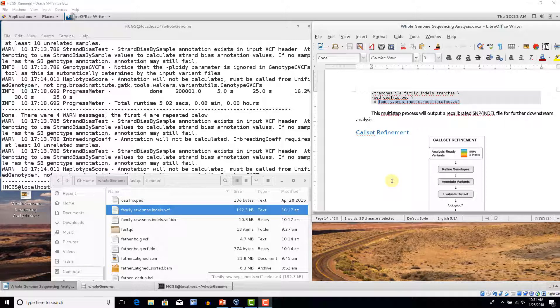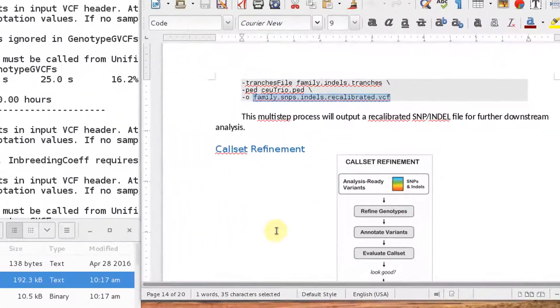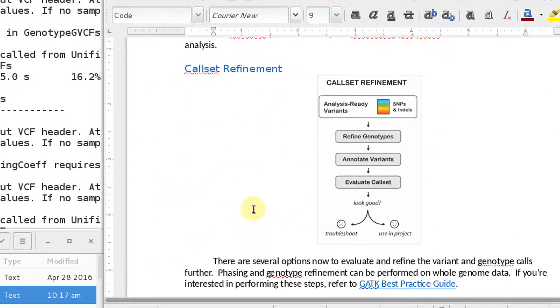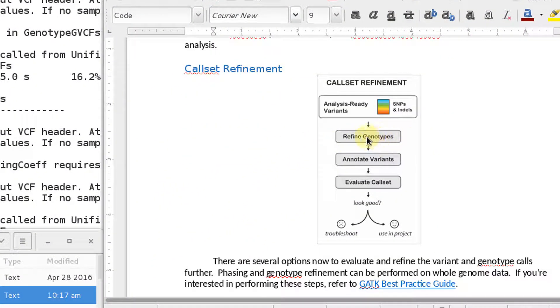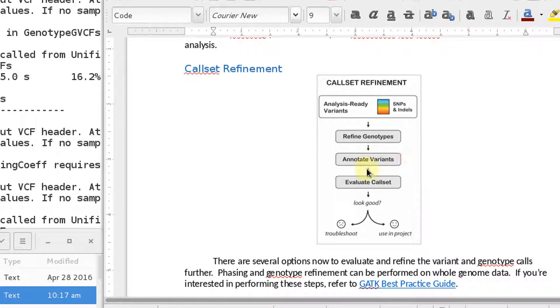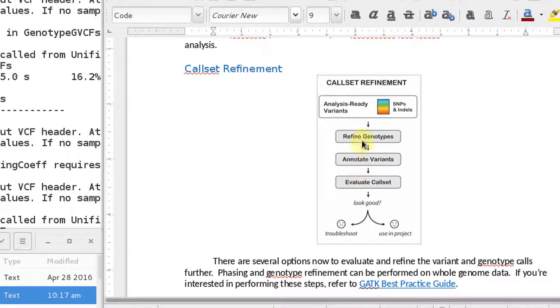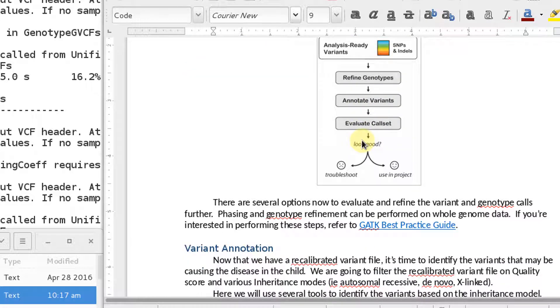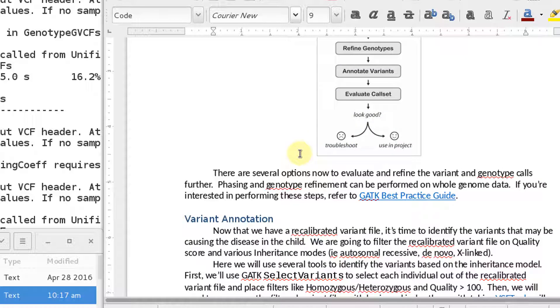A lot of these tools here will be different based on what you're interested in. You can see here that GATK recommends a refining of genotypes, then you need to annotate them, and then you evaluate your call set. So there are various tools out there that will help you refine your genotypes. I'm not going to go into those, but I encourage you to look that up if you need to go that route.